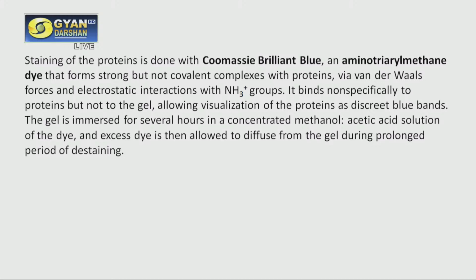You can de-stain it to remove the excess stain. But for proteins, normally we use this CBB, as we call it in short, that is Coomassie Brilliant Blue.